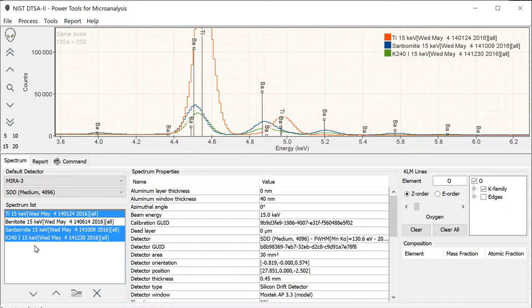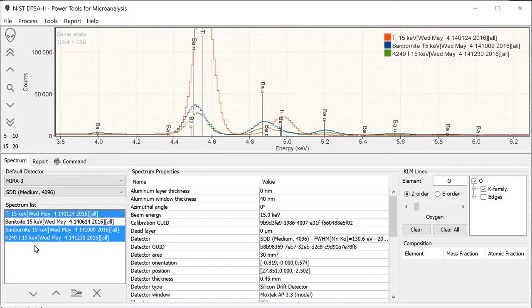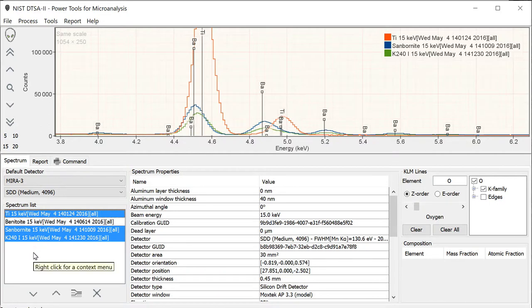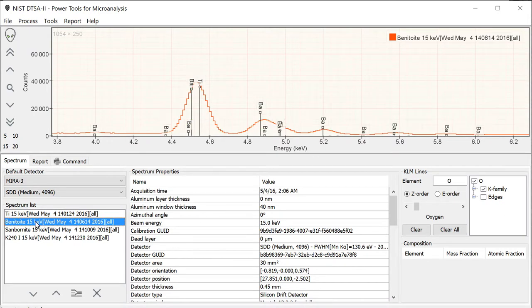However, there are situations, and these are not infrequent, in which a reference is necessary. One thing that is worth clarifying is that really the references are only necessary for the standard, in the sense that if the standard has no interferences then it can be fit directly to the unknown. It's only in the situation in which the standard has interferences that you need to use a peak shape reference. So, how do you know whether you need a peak shape reference?